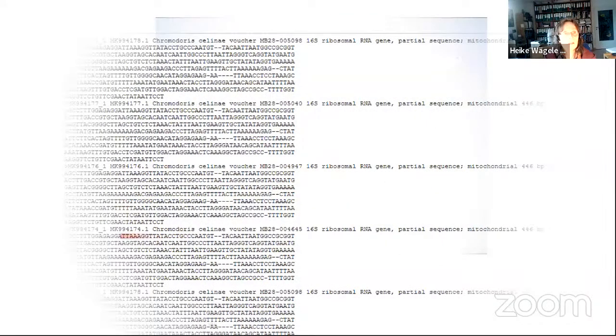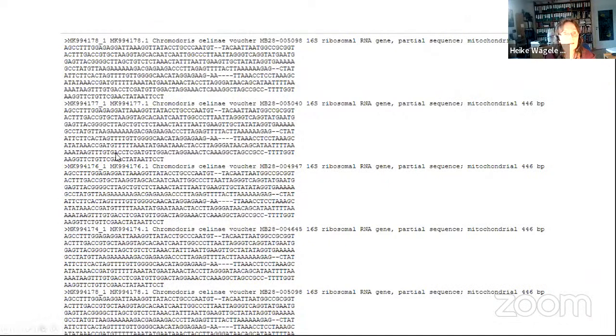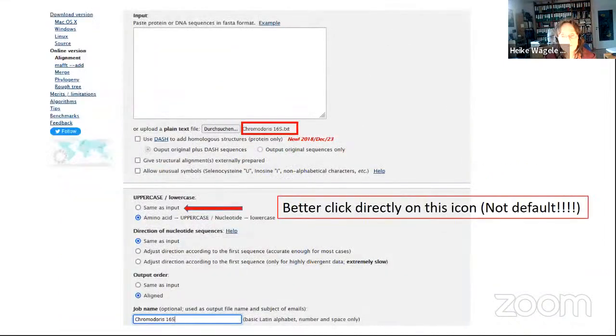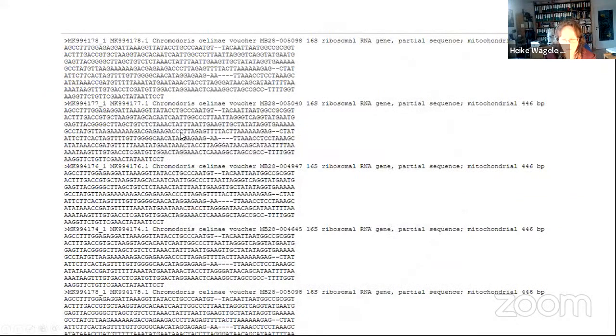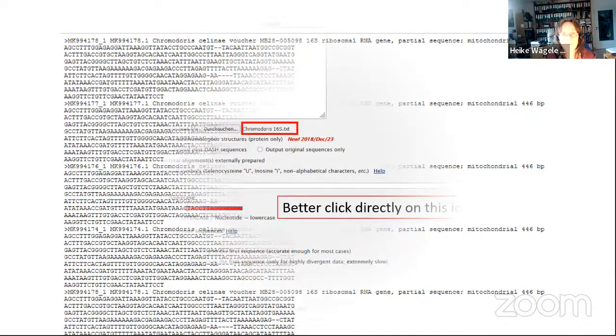And then it looks like this. So we have again these sequences below, this is now with the editor. I wanted to tell you, if you have this problem, I changed it. I changed the letters into uppercase because I prefer this for showing and working with.